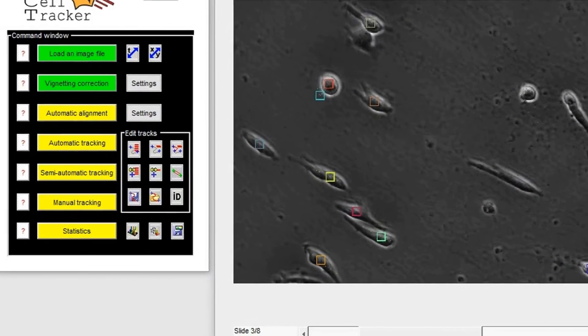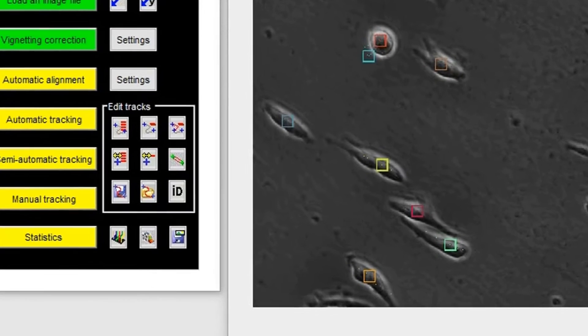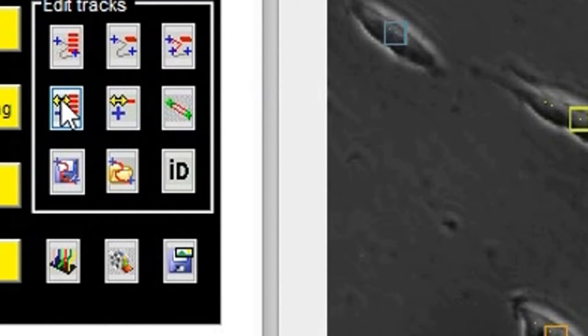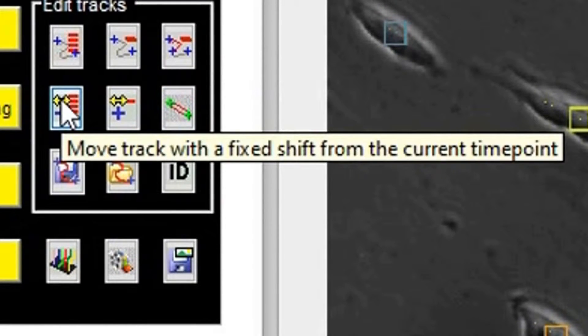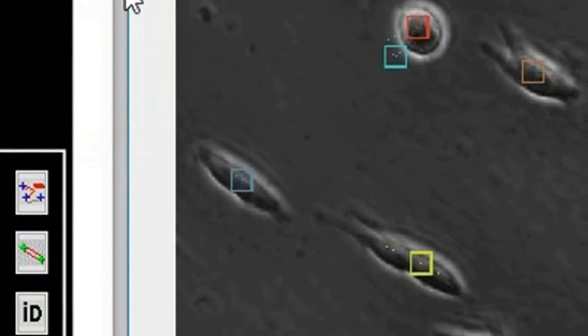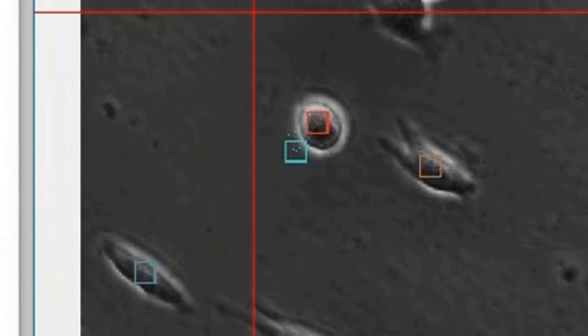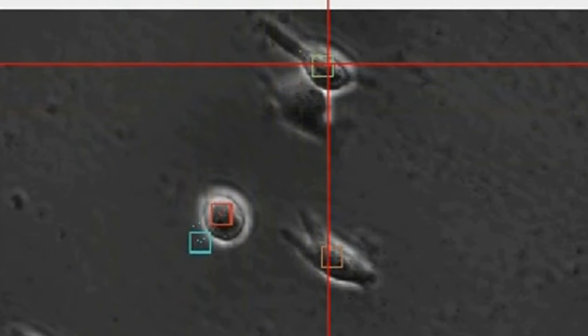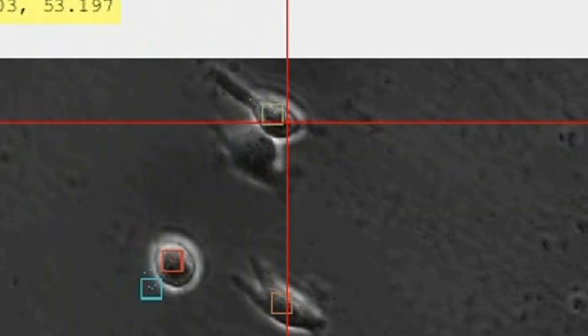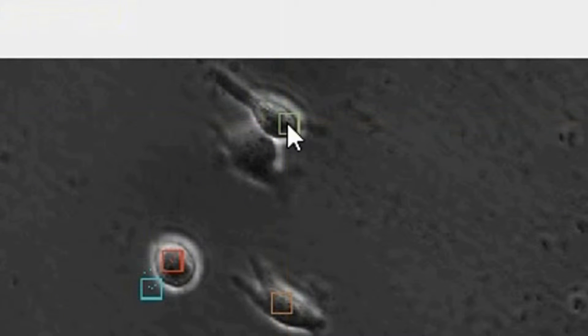If a track is correct but slightly shifted, you can move the entire track by a constant shift using this button. First, select the track you want to move, then click on the new position.